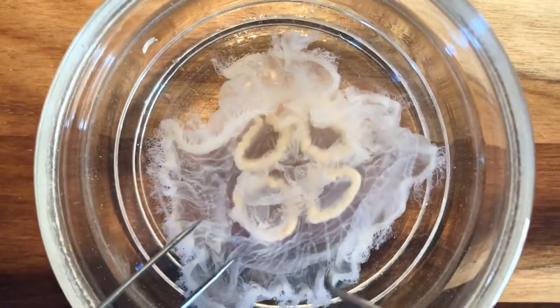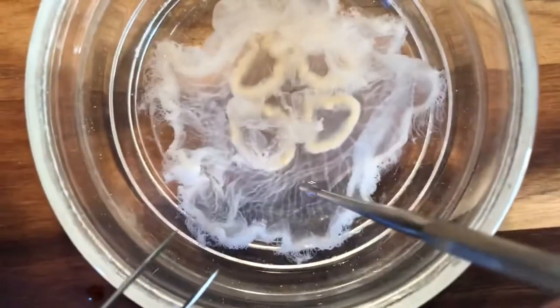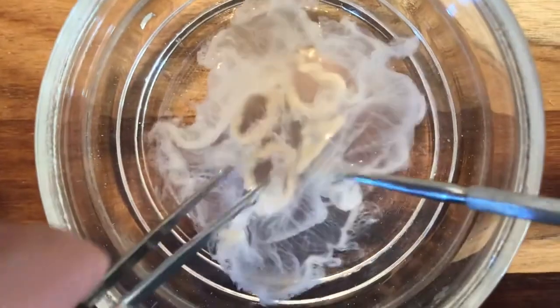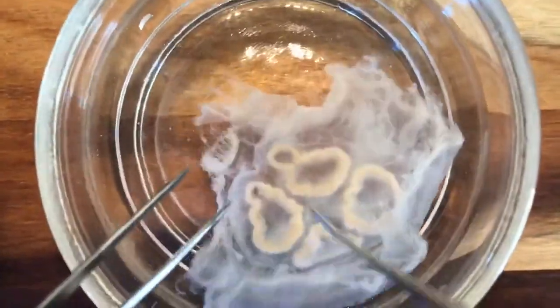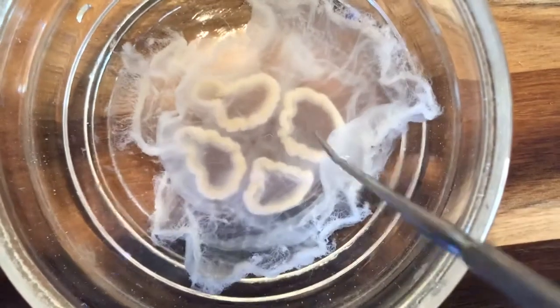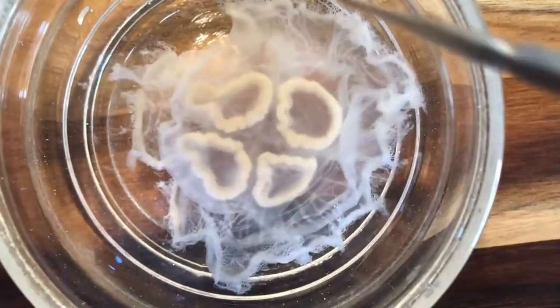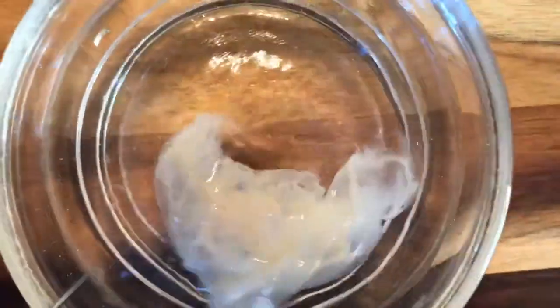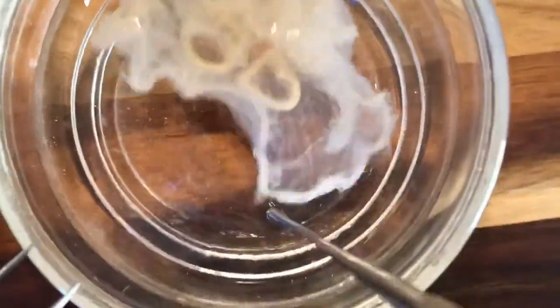The sub-umbrella is this portion of the body right here. The ex-umbrella — I'm going to flip the jellyfish quickly — the ex-umbrella is up here. This is on the aboral surface. For those of you who have watched Finding Nemo, when Marlin and Dory are hopping on the jellyfishes, they are hopping on the jellyfishes' ex-umbrellas.